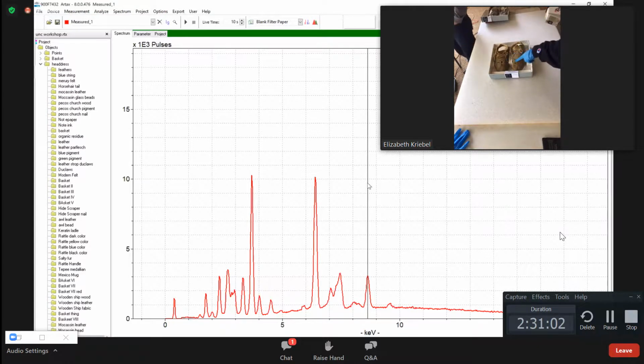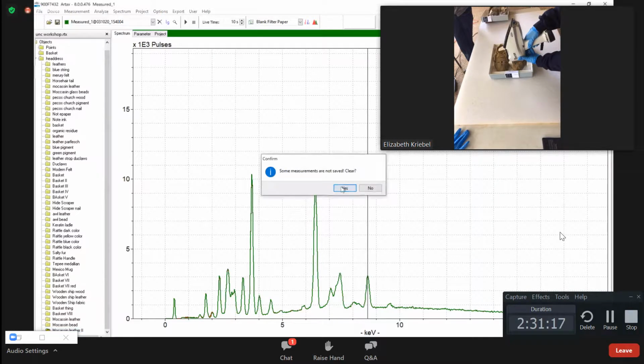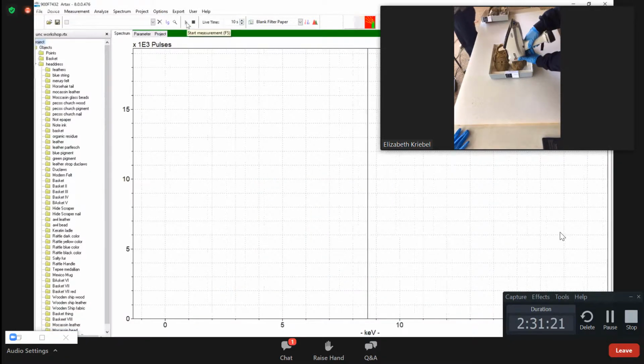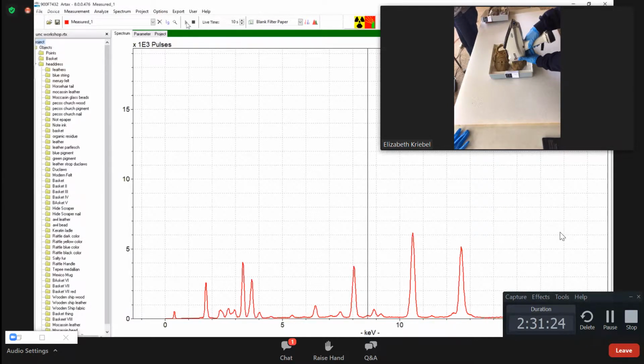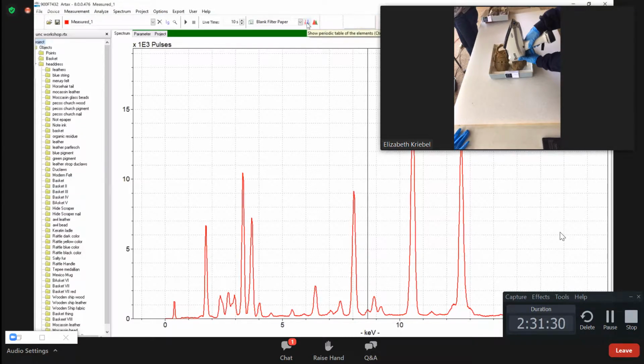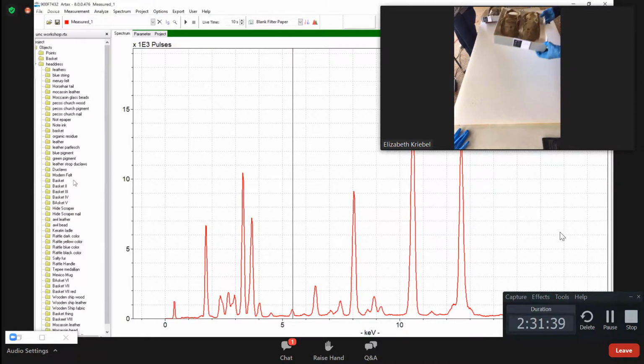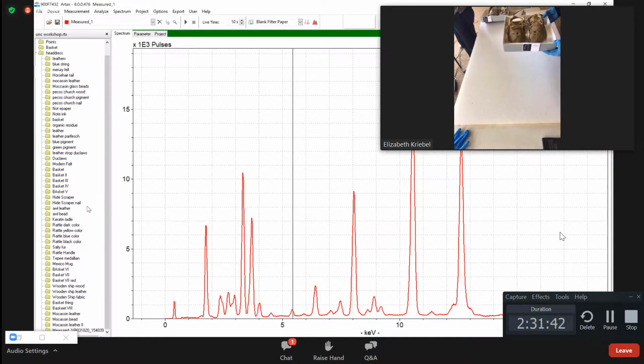Should we try these colored beads? Yeah, that'd be great. The green is definitely different. Do you need the object number on this still? Yeah, but you can do it at the end. Okay. All right, I'm ready when you are. All right, starting. Lead glass. No arsenic, and copper is our colorant. Wow, okay. A little bit of chromium thrown in there. I'm surprised there's no arsenic actually.